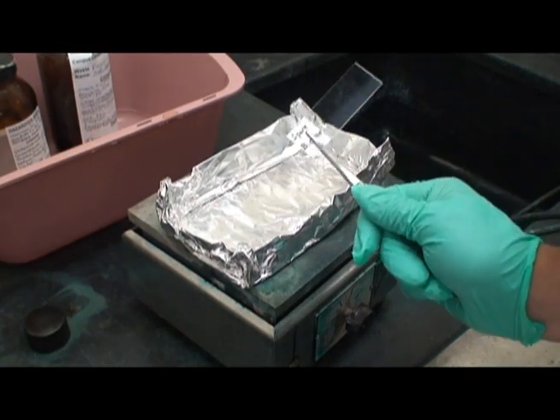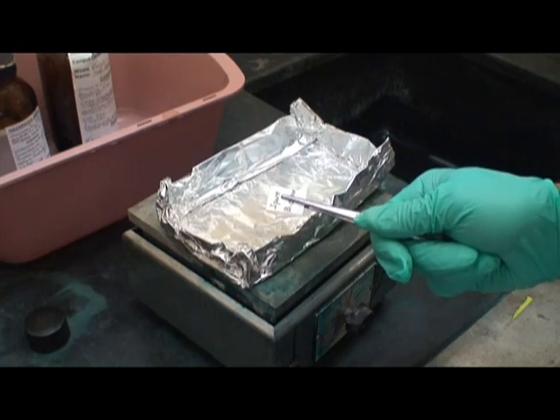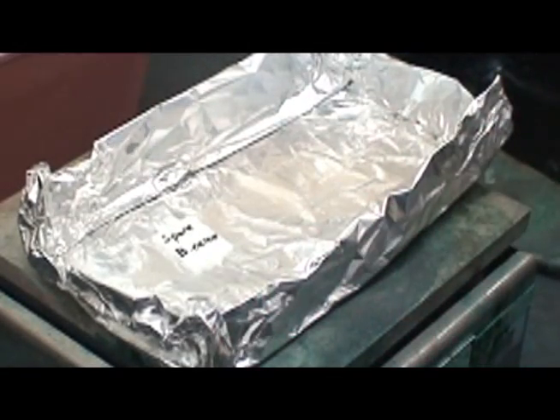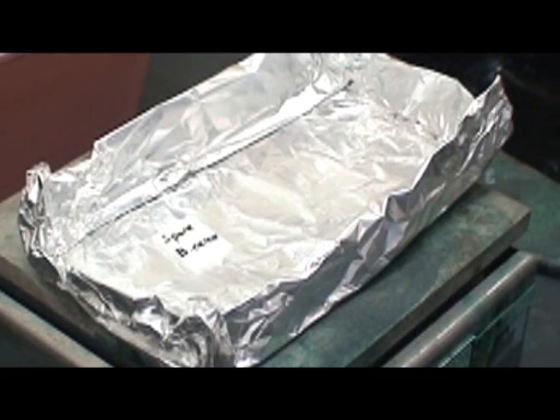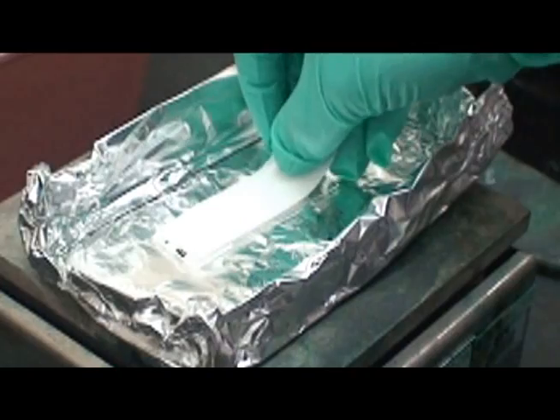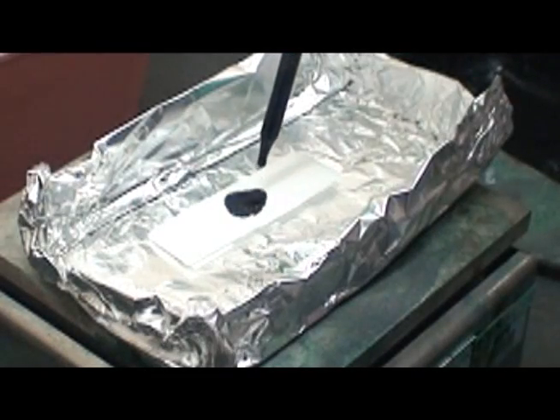After the smear has been dried and fixed to the slide, place it on a heat block. An aluminum foil tray can be used to contain any overflow of stain. Before the glass becomes hot, place a piece of paper towel over the slide as shown here and flood the towel with 5% malachite green.